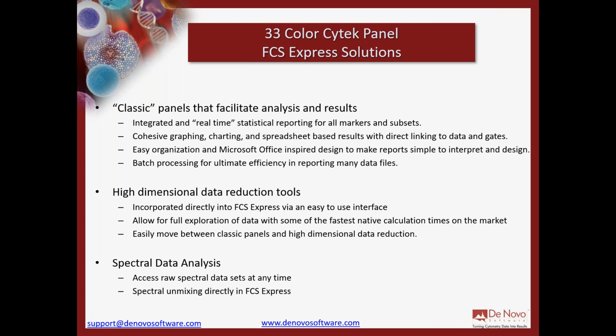Now, the other component that's very unique to FCS Express is that you can access that raw spectral data at any time, right? You've gone out of your way to get this awesome instrument from the Cytek folks. It has all of the raw spectral data and spectrum signatures associated with it. And in FCS Express, you don't have to throw that away and just work with the unmixed data set. You can actually access the raw spectral data, and you can even do spectral unmixing directly in the software itself.